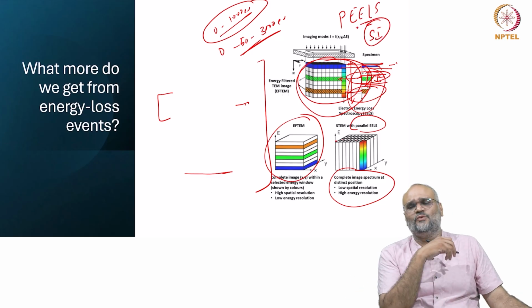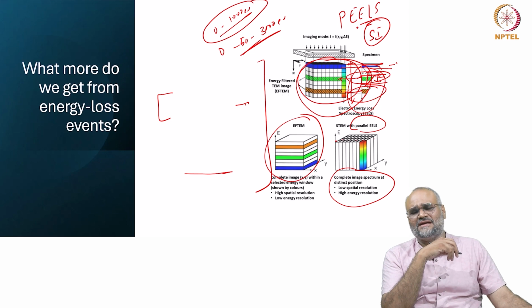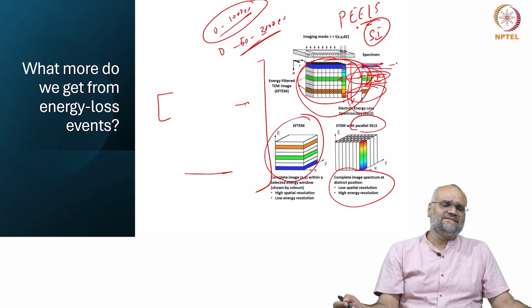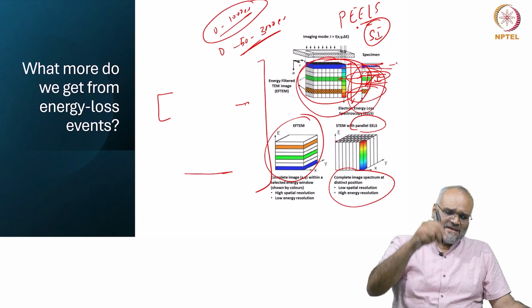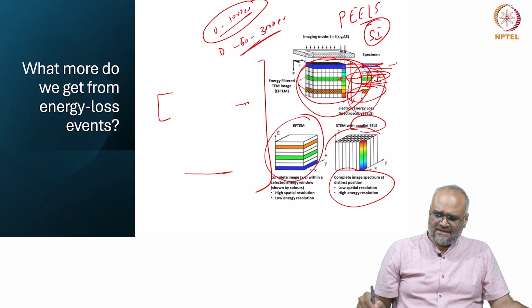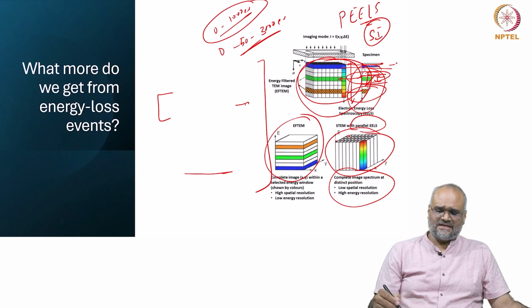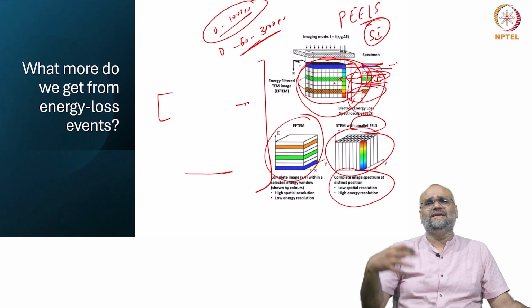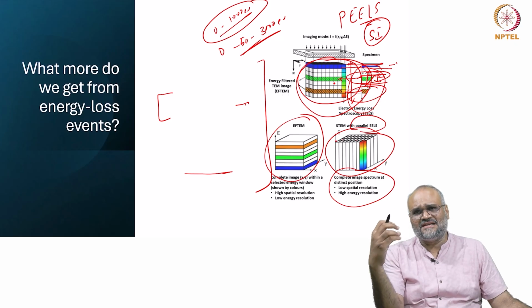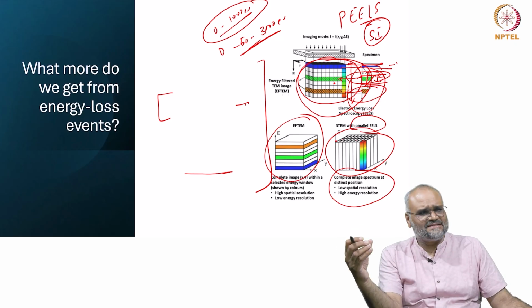Depending on which microscope manufacturer you are looking at, there are different terminologies with which you can collect this image. Essentially, the idea is that from every pixel for which I collect the image, I am also collecting the entire data cube, which consists of the composite of all this energy related information, which has undergone inelastic scattering.